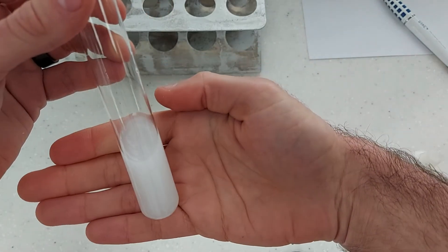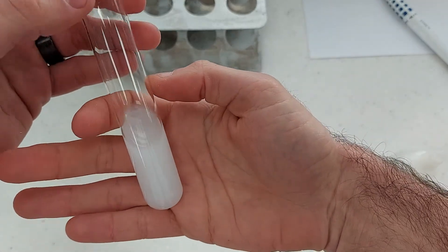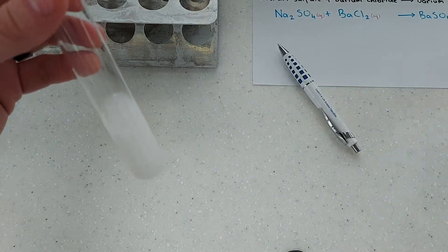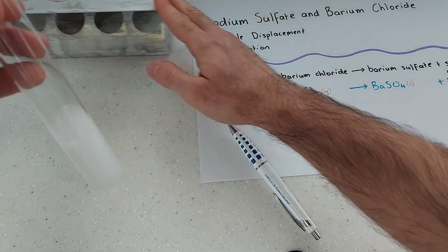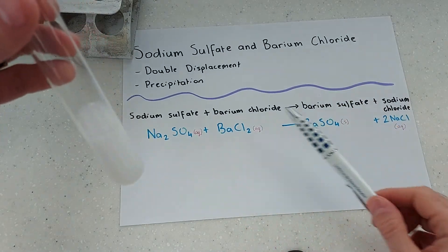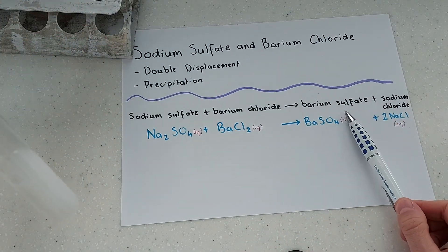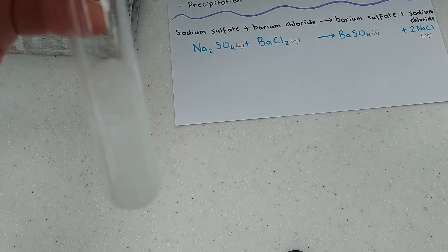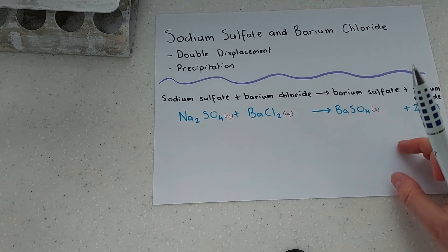Now that cloudiness that you can see is actually the barium sulfate that I've produced as a precipitate. So let's see if I can focus on the test tube itself. There we go. And so that is an example of a double displacement reaction between sodium sulfate and barium chloride.